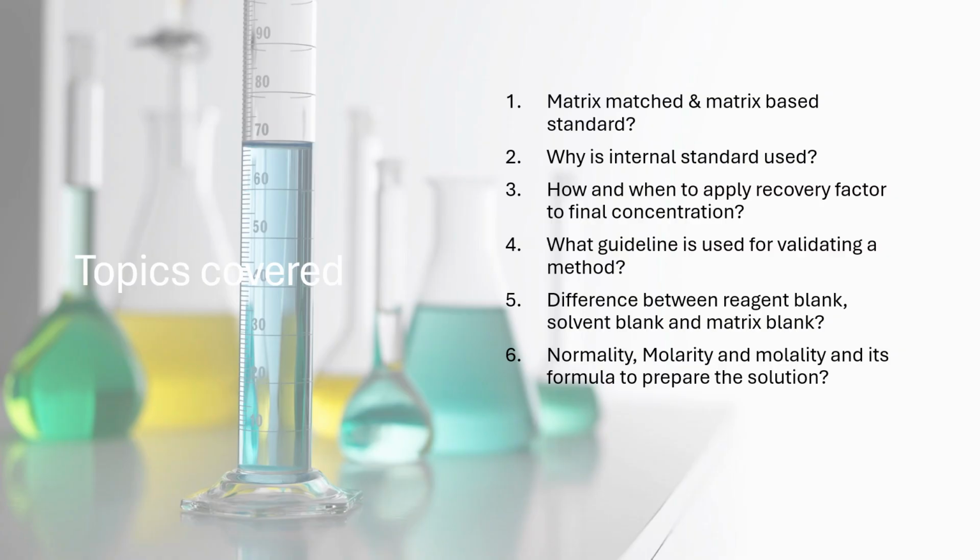So the topics covered in this video are matrix matched and matrix based standard, why is internal standard used, how and when to apply recovery factor to final concentration, what guideline is used for validating a method, difference between reagent blank, solvent blank and matrix blank, normality, molarity and molality and its formula to prepare the solution.